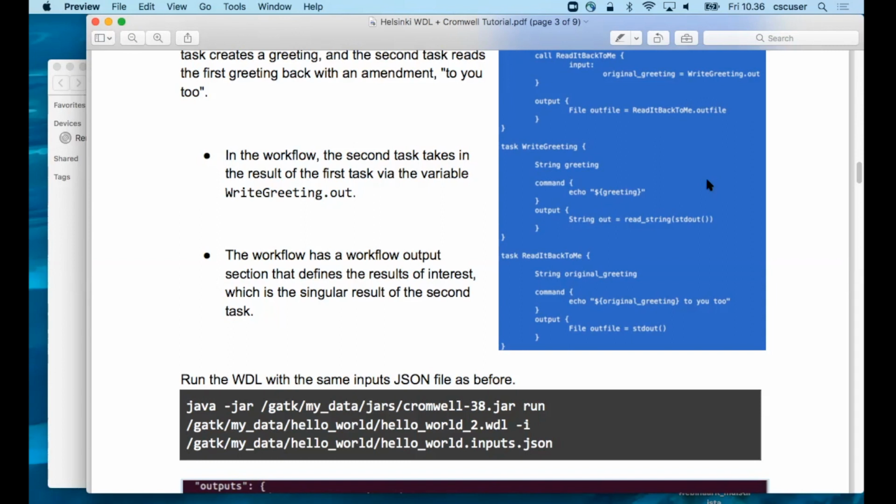If they're very different, and if it's a long-running thing, you're better off having it write to disk. But if they're very small operations, or if you just had to copy 100 gigs of data to a small operation and then the next thing, definitely put them in the same task. Balancing those kinds of things can be a little different compared to how we traditionally work, where you assume everything.